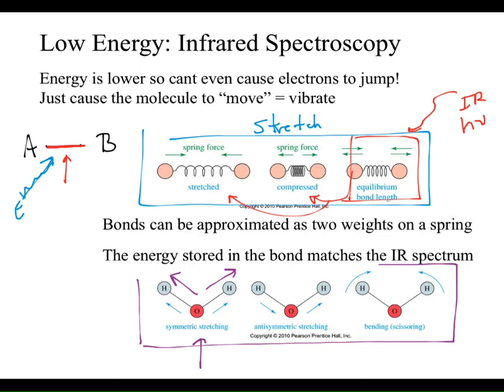With UV spectroscopy, you didn't see me show anything beyond this. We just said this is what it does, and we left it alone. We will come back and look at UV spectra, but for the most part, we don't have to stress about their spectra. IR, on the other hand, we do. So now we have to shift to looking at an IR spectrum. Where do these things show up?